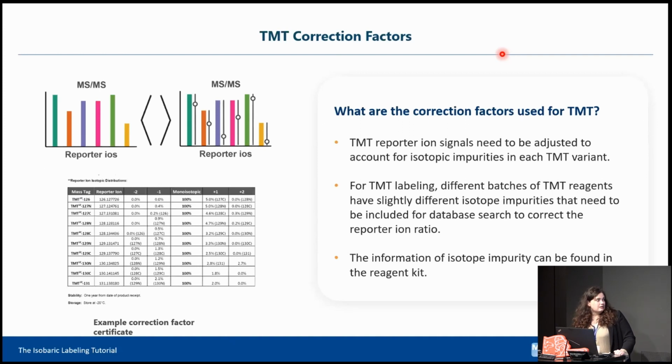This kit information is exactly like in this screenshot. This is one example that I just took from the website of Thermo Fisher, but there are many of them, and this one exactly depends on the kit that you use. The idea is that today I will show you, given that you have this kit, how you then do that in MaxQuant and then Perseus.